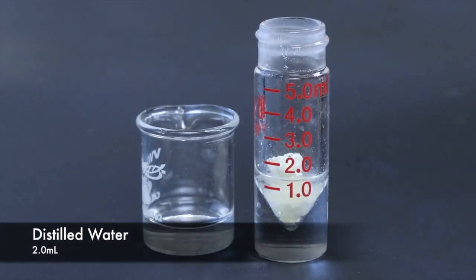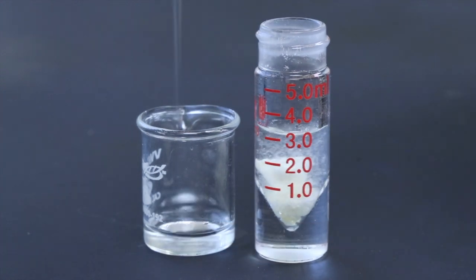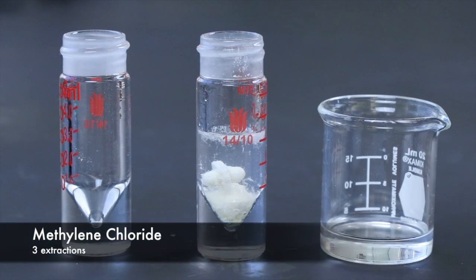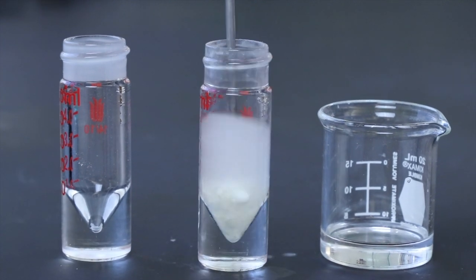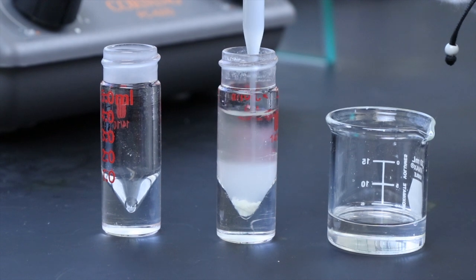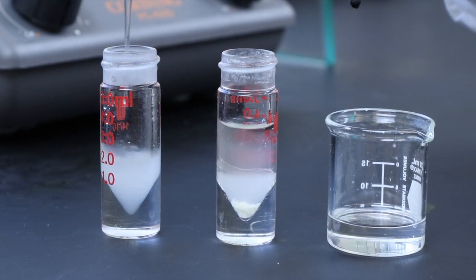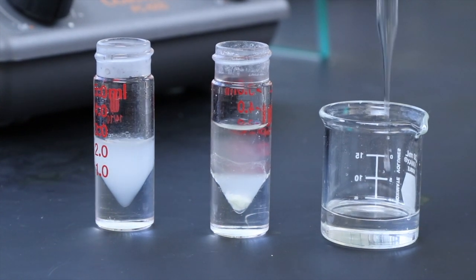Initially, I'll dilute the basic solution by adding some distilled water, and then I can go ahead and start the methylene chloride extractions. As you can see, the alcohol product doesn't dissolve super well at the beginning, so I'll be stirring it and trying to break it up to dissolve it better. So the solid alcohol still hasn't dissolved completely, but it should continue to dissolve as I keep doing further extractions.